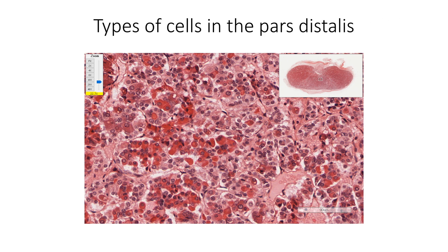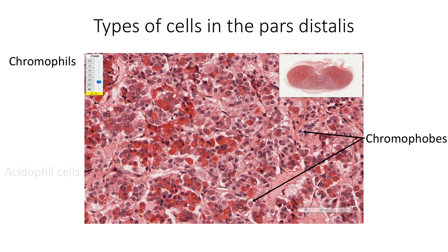Based on their staining character, cells in the pars distalis are classified as chromophobes and chromophils. Chromophils are further classified as acidophils, taking eosin stain, and basophils, taking hematoxylin stain. About 40% of the cells are acidophils, 10% are basophils, and the remaining 50% are chromophobe cells.